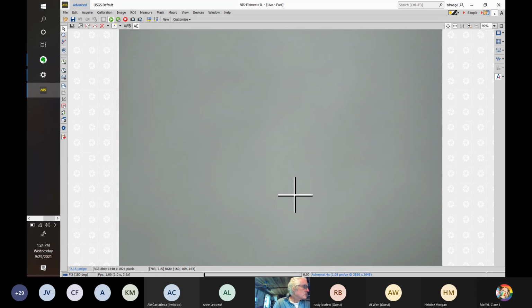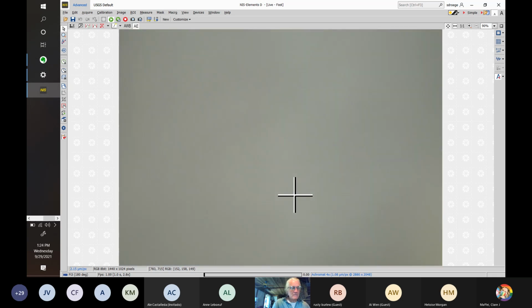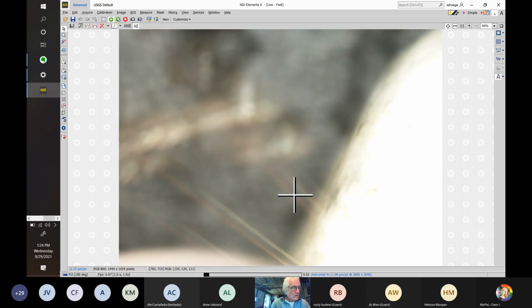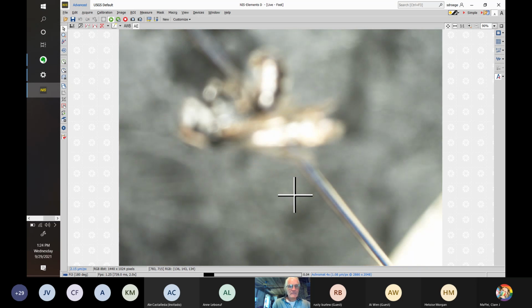All right, let's go to Chelostoma, which is also in that group of genera that are small and black and Megachilidae. What do we have in front of us? This is Chelostoma philadelphi.